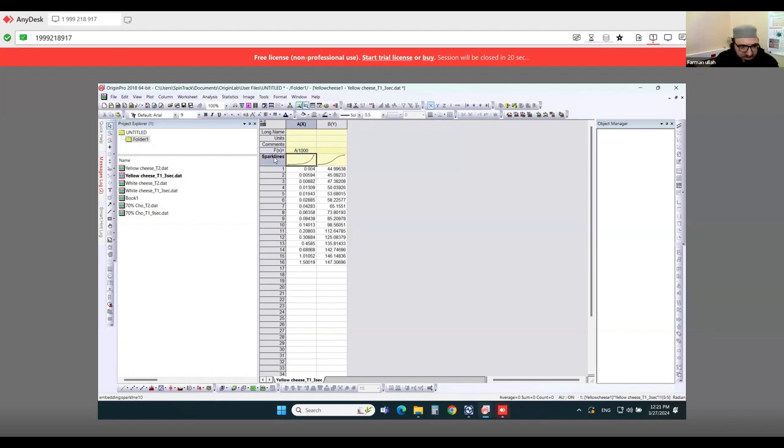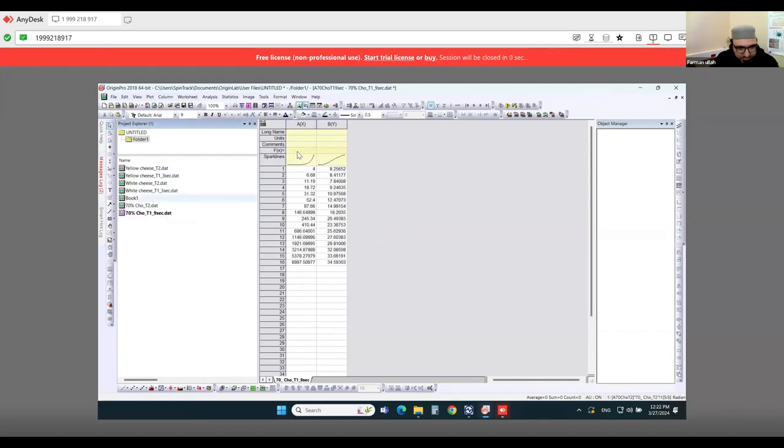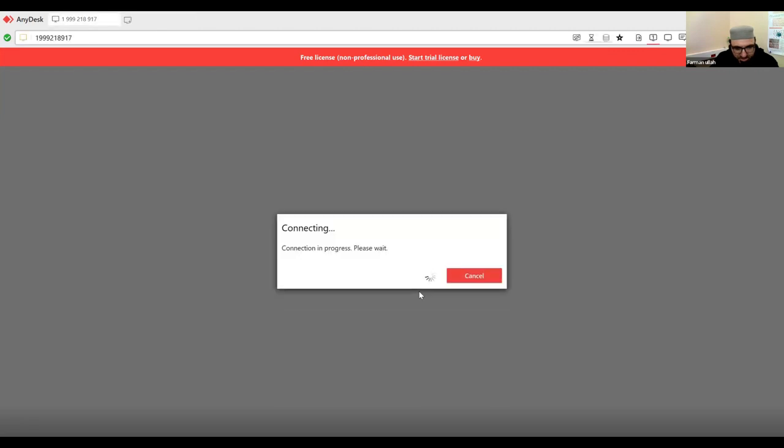I'm doing this because we don't have too many results, we have few results, and I want to show the x-axis in seconds.